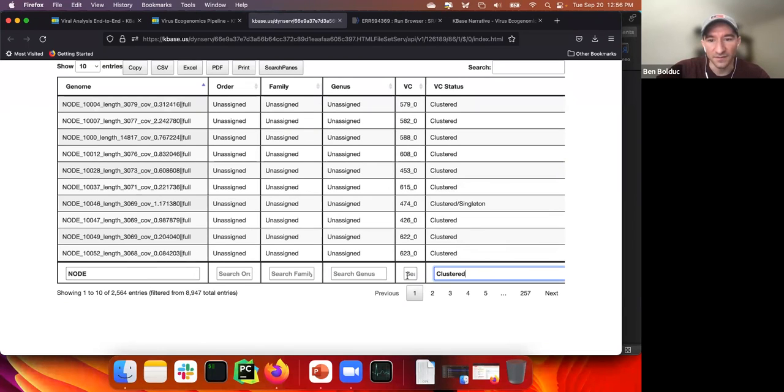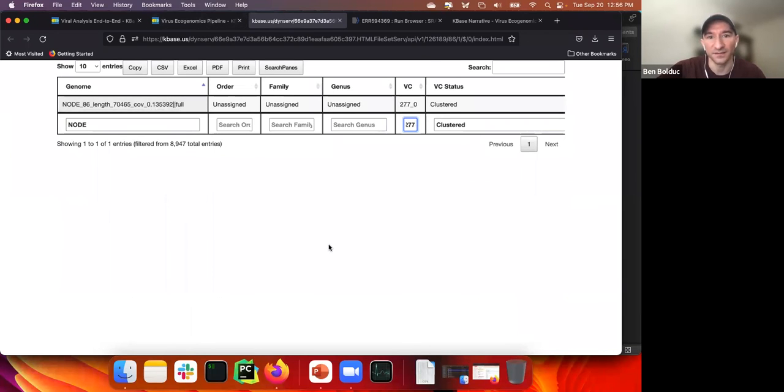It's live filtering 9,000 things, so it's going to take a second. And then what was that VC? Was it 277? Let's see. I bet it was 277. So one of the challenges, and I need to figure out how to implement this in KBase, I'm talking to the staff, is how to more quickly identify novel viruses. The only way that I can really explain how to do this is to look for VCs that have both your sequence and a reference sequence in there. That's the only way you're going to be able to find sequences that match to known viruses.